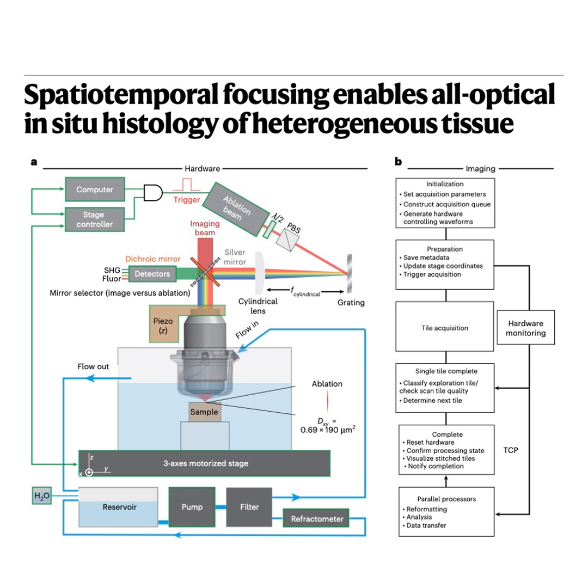It works. The software compares the measured RI to the target value. If it detects drift, usually indicating water has evaporated, increasing the DMSO concentration and thus the RI, it automatically triggers a microperistaltic pump. To do what? Add more DMSO? No, to add tiny, precisely measured amounts of water back into the closed-loop system to bring the RI back down to the set point. Wow. A self-correcting system based on a camera watching a screen.